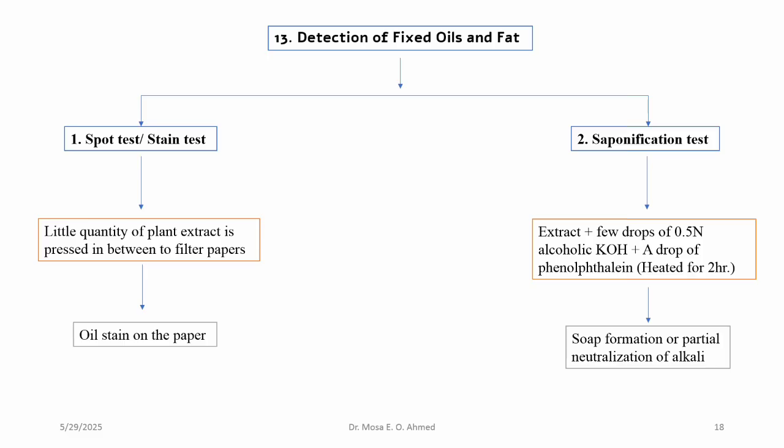This test is based on the formation of soap by the addition of potassium hydroxide. If fixed oil or fat is present in the plant extract, soap is formed, or partial neutralization of the alkali occurs if it is a free fatty acid.